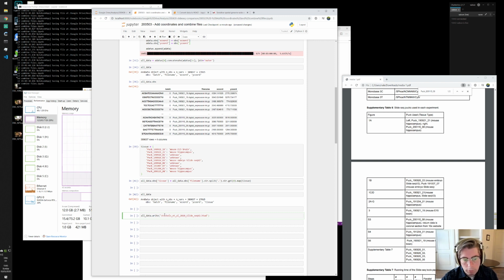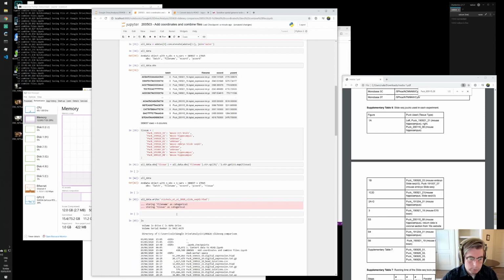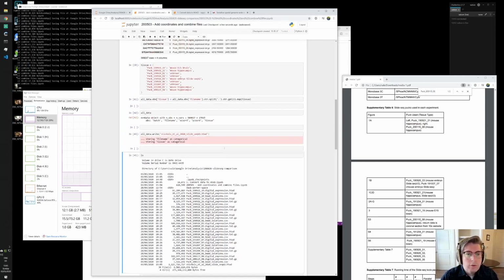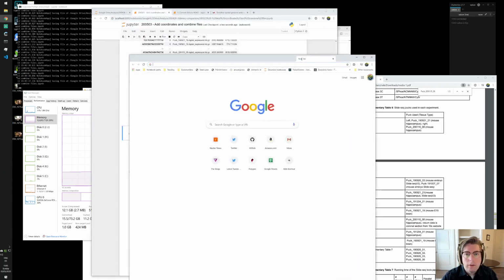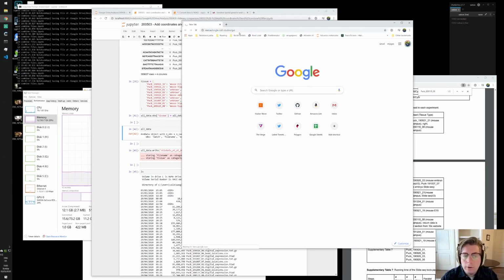So then I just have all of the data like this. It's not very small, it's about 1 gigabyte, but we only need to deal with this one file, and it actually is pretty fast to read. Now when I've done this, because I didn't know this number before, I'm going to add that number to my spreadsheet of experiments.